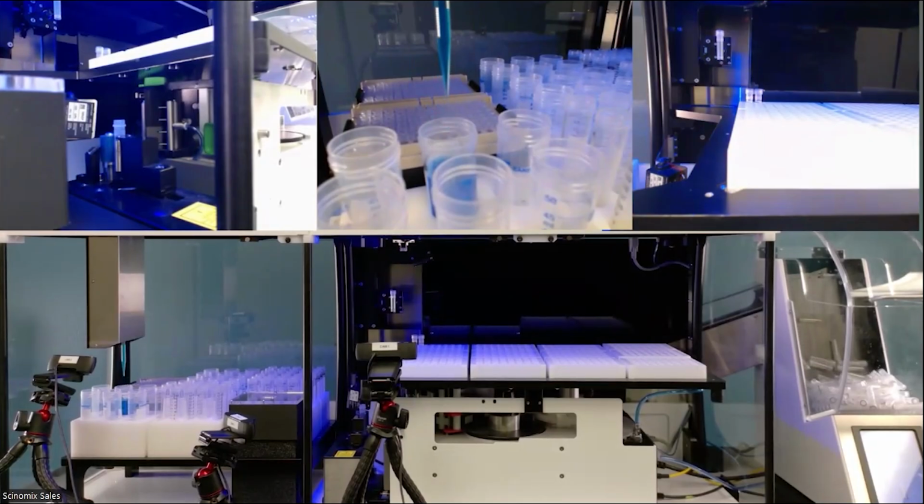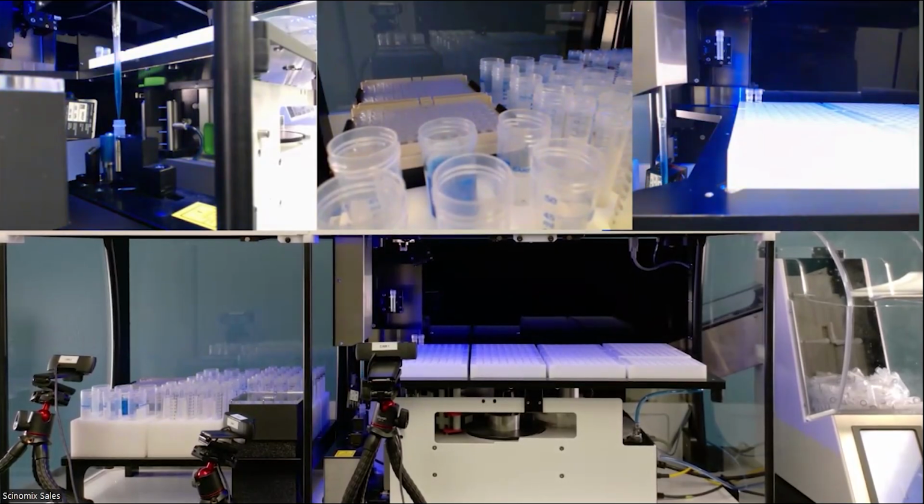And you'll see here it's moving on to its final tube. We're going to do about a 3-tube run here.